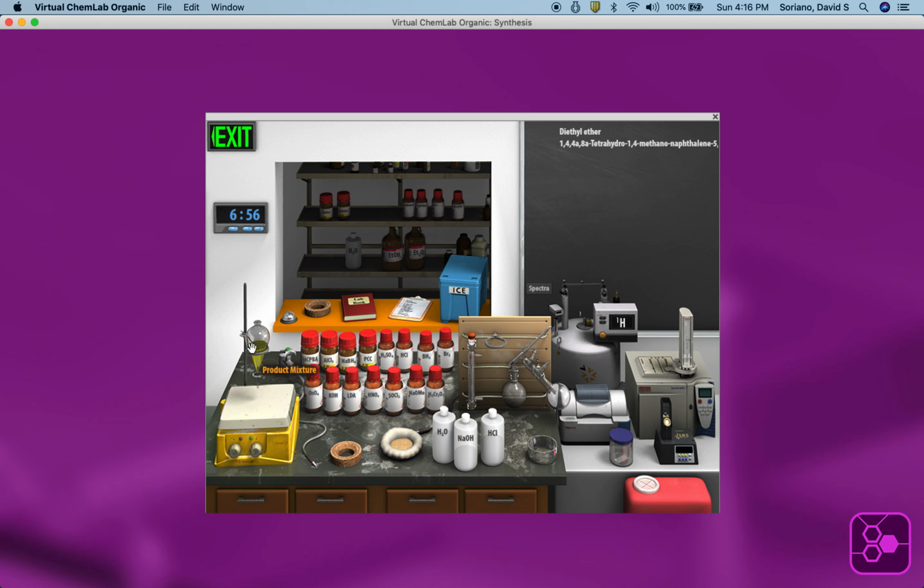They want us to wash it first, I guess. So let me put, I don't know why, but let me put some water in there. Okay. You never know. It doesn't hurt, right? You're going to wash it. Now, the lower layer is the water. There's nothing in it. I learn something every time I do one of these runs. The upper layer is the solvent and the product. Now we're going to take that upper layer, move it into a cork ring. Presumably it's been dried with drying agent and filtered.